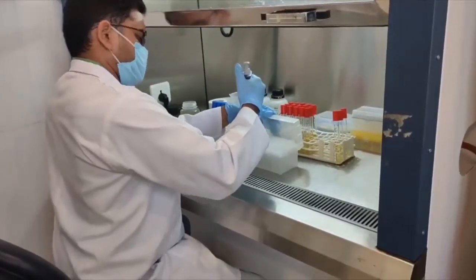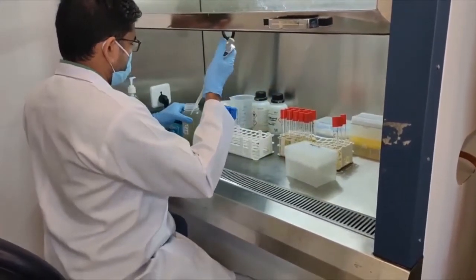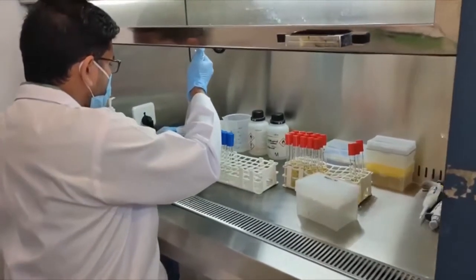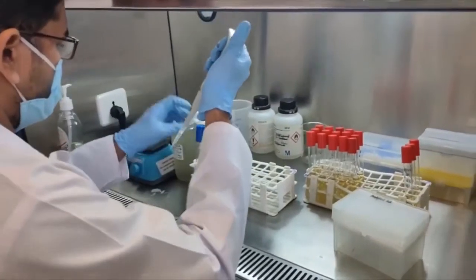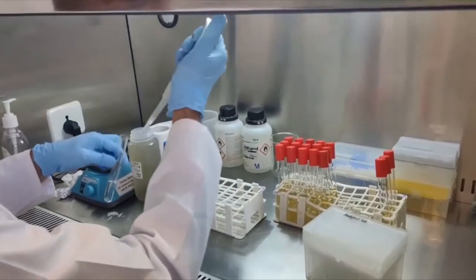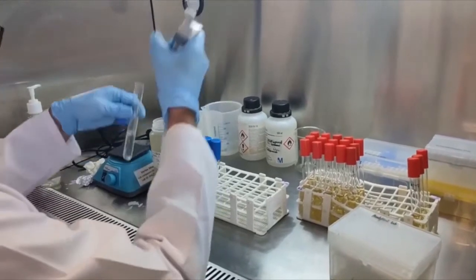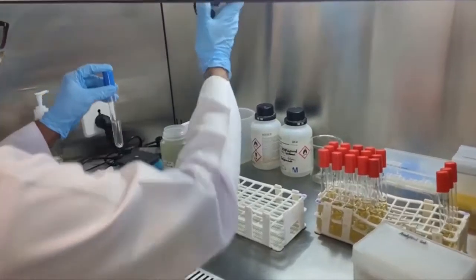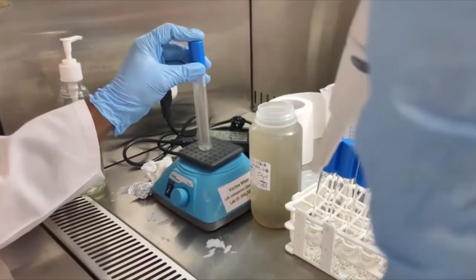Take 1 ml of sample from the sample bottle and add it into a tube with 9 ml of sterile normal saline. This is the 10⁻¹ dilution, which contains 0.1 gram or 0.1 ml of the original sample. Properly mix this diluted sample by vortexing.